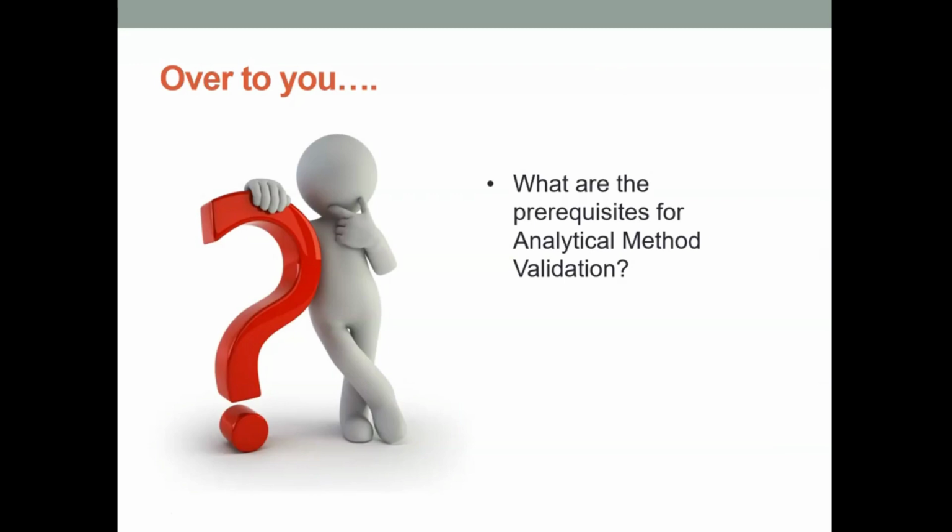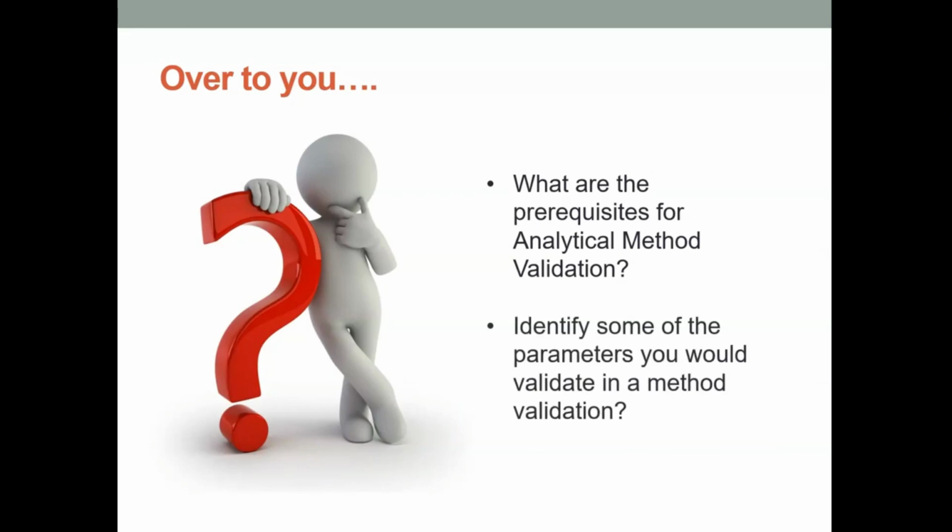So what are the prerequisites for analytical method validation? Can you identify some of the parameters you would validate in a method validation?